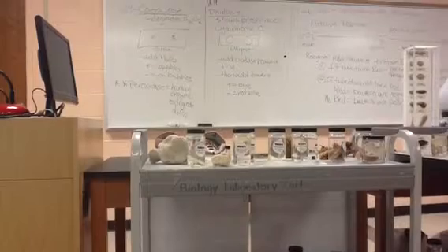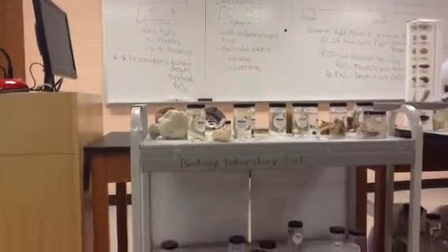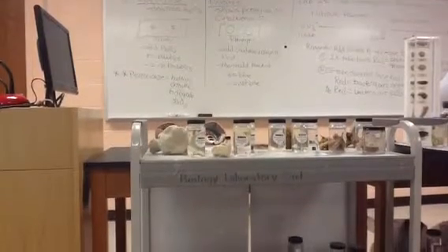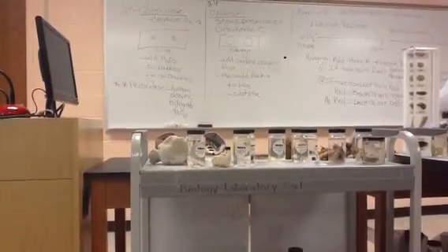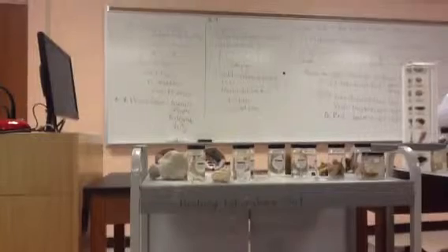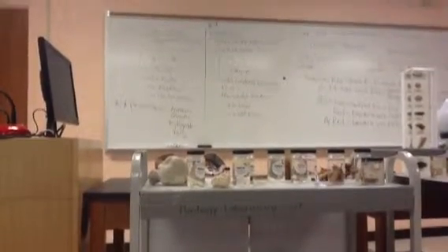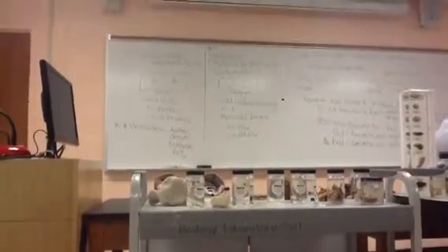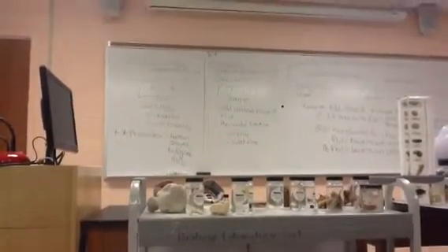Questions on the oxidase test? All right, so that's nice and easy. Lab 24, you get your results today. There's no incubation. Lab 25, we're back to having to inoculate tubes, put them in the incubator, come back on Monday and get the results.